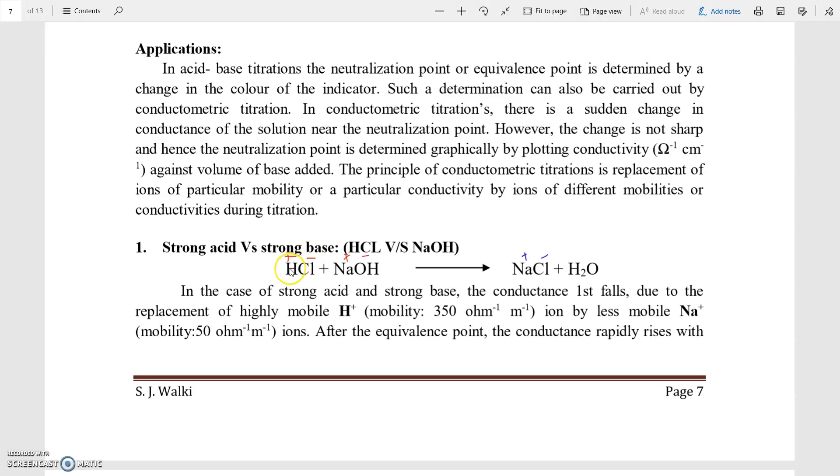Here, we are going to take the NaOH in burette and we are going to take the HCl in the beaker. In HCl, we are going to dip the conductivity cell. Initial conductivity of the HCl solution is noted. Then, we are going to add the NaOH from the burette into beaker.